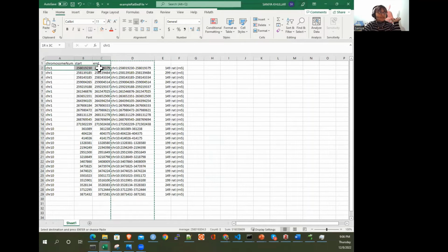I'm just going to take this ABC part, and the first part you do not need the header at all. And often bed files do not have the header. They can have some other annotation, but it's assumed that it's a chromosome number, then the start, then the end, and then there are additional columns out there that you can look at. So whatever format it is, the data.